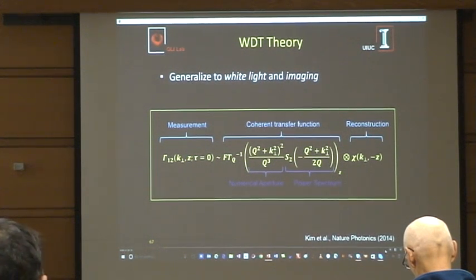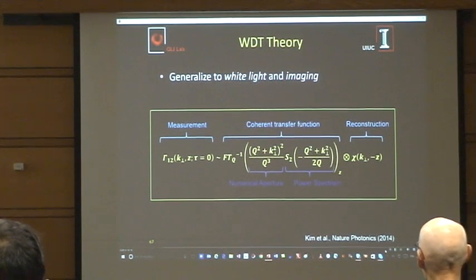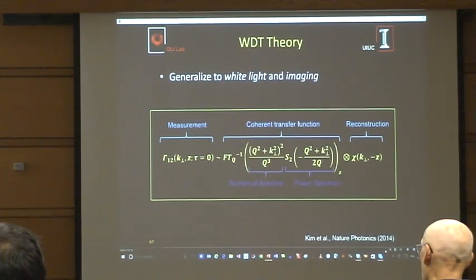So notice, if you only have high numerical aperture with monochromatic light, it doesn't work. So if you use this with a laser, it doesn't work. And vice versa, if you use white light with low numerical aperture, it doesn't work. So it's a beautiful thing that they work together. Normally, if you were to make a Mach-Zehnder interferometer aligned within the coherence length, which is 1.2 microns for white light, that would be a terrible task for grad students.